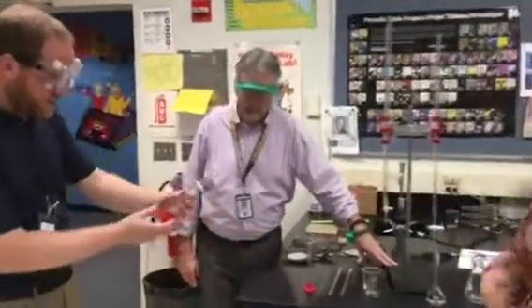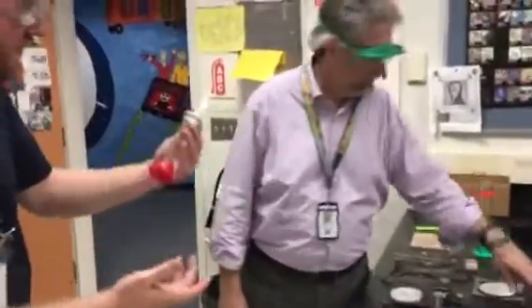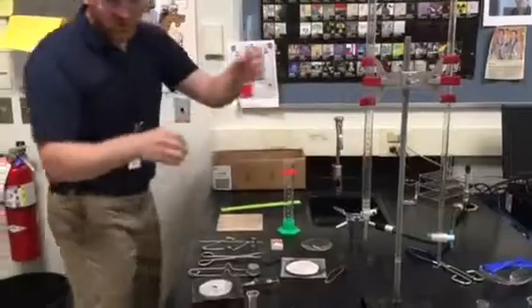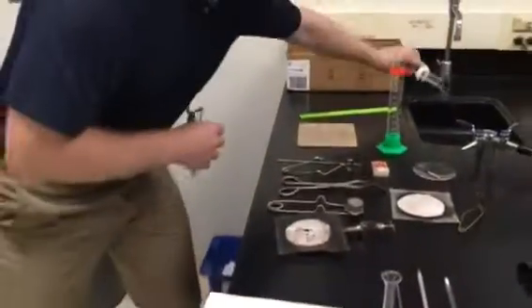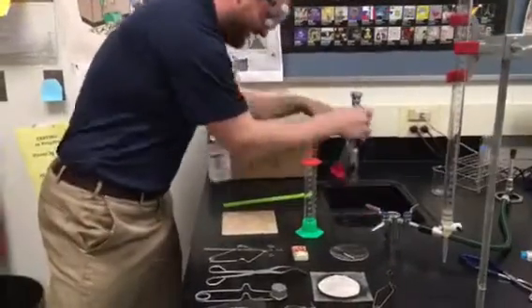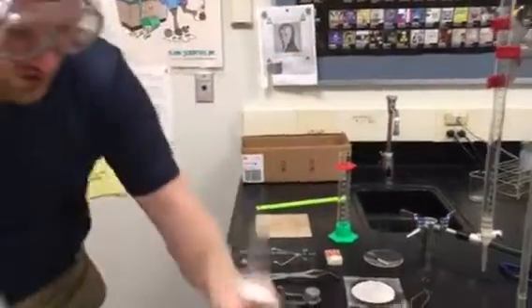Yeah, so I'll take this first graduated cylinder here. This one measures up to 50. Let me just get some water in here. If we can zoom the camera in a little more. Okay, too much.